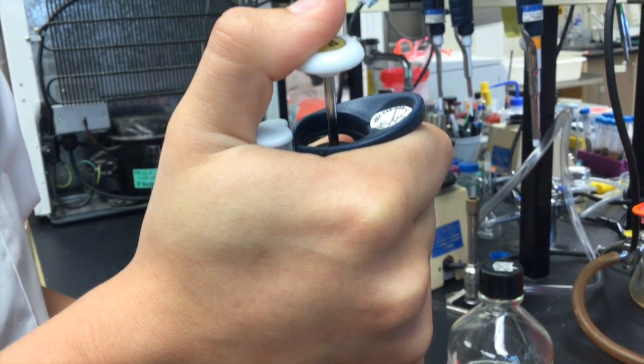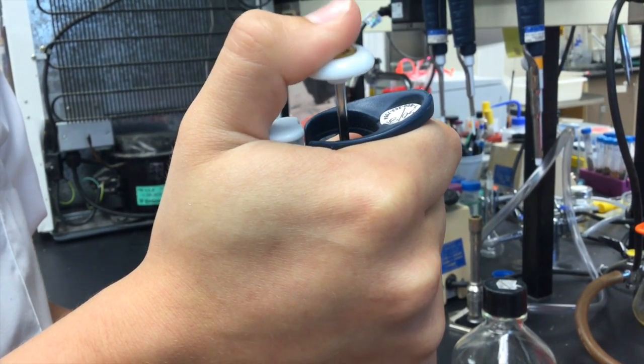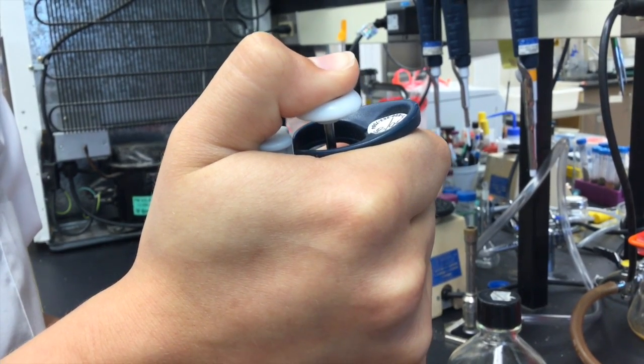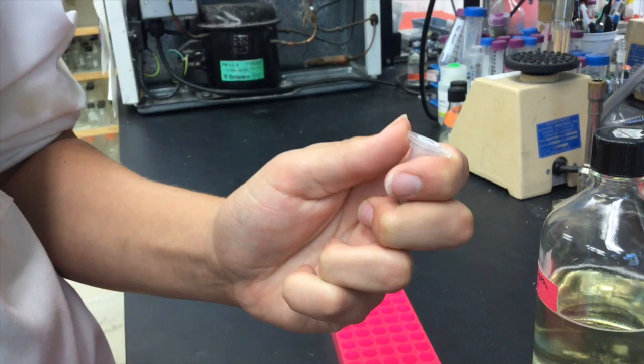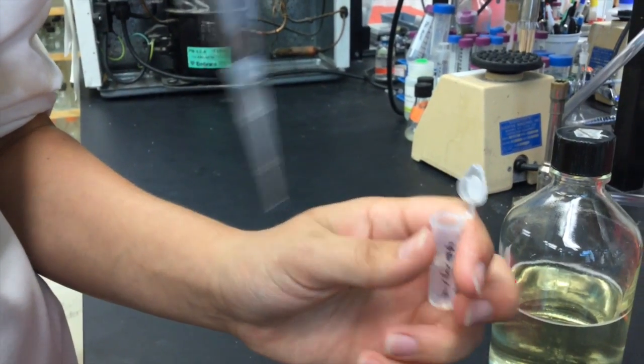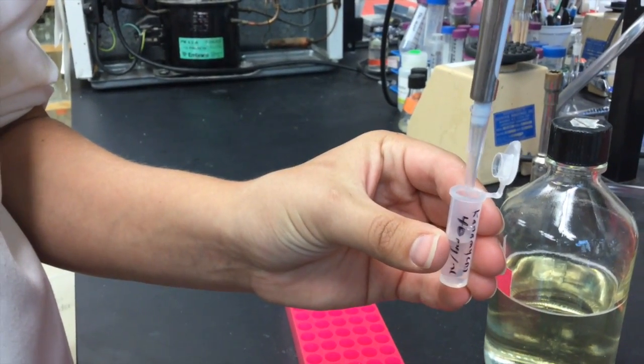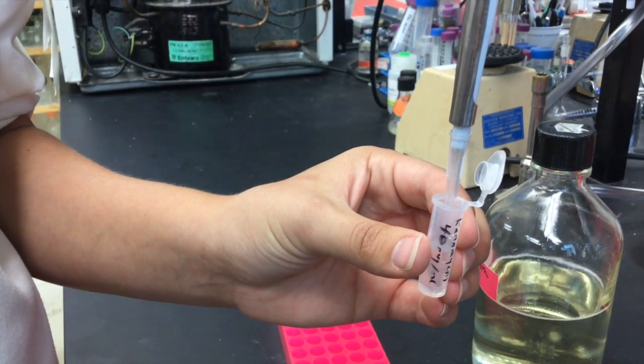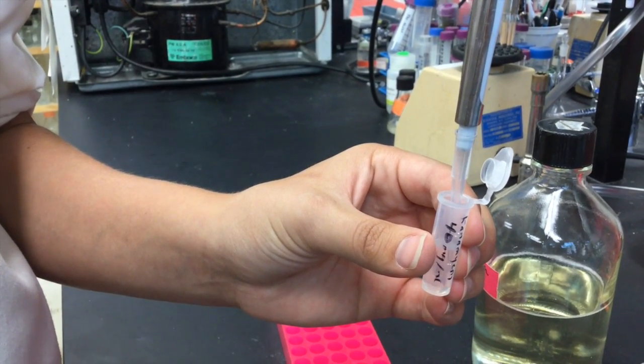Depress the plunger until you feel the initial resistance. This empties the micropipetter so that it can draw up the liquid. Remove the cap from the liquid and insert the tip into the solution. Make sure you place the tip just barely below the surface of the liquid and not as deep as possible.